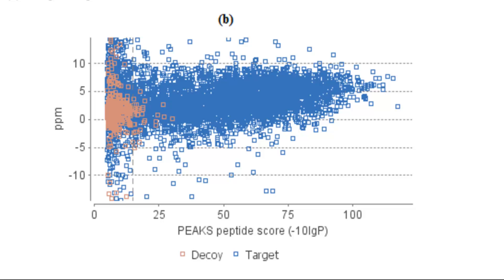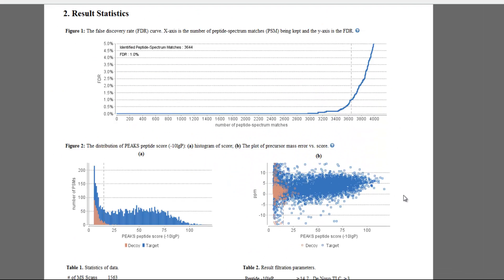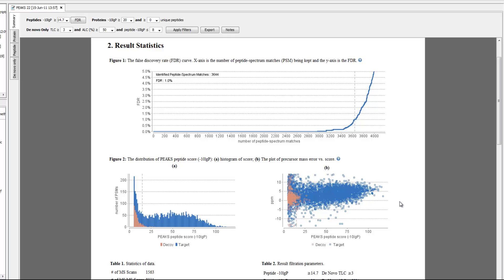Second, this scatter plot compares the precursor mass error with the peptide score. If you are using a high-resolution instrument, you should see that the error is small for the high-scoring peptides, and starts to scatter for peptides below the score threshold.